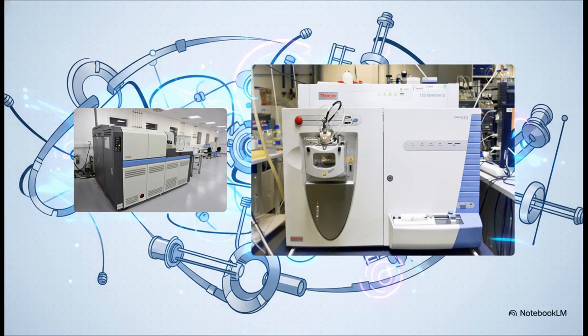To ground all this abstract theory in reality, here's what this invisible journey actually looks like from the outside. These are real, highly complex mass spectrometry setups you'd find in a high-end modern lab today. Behind those sleek exterior panels are all the intricate vacuum pumps, ion sources, quadrupole rods, and ultra-delicate detectors that make this whole high-tech sorting process possible.